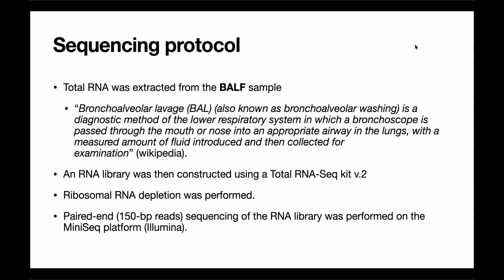This isn't quite the entire story because there's a standard protocol for doing this. And I'll show you just a few key points. It is very, very important for any sequencing experiment to prepare your sample properly. So the first thing you do is you want to sample the right biological compartment. In this particular case, you had somebody with pneumonia that you suspected was viral. So the logical place to sample would be from the lungs.